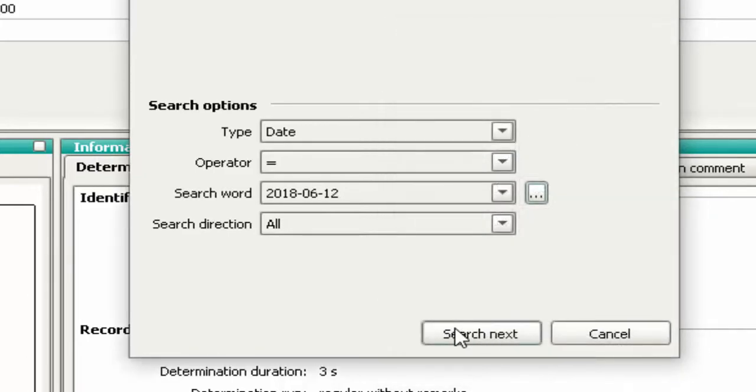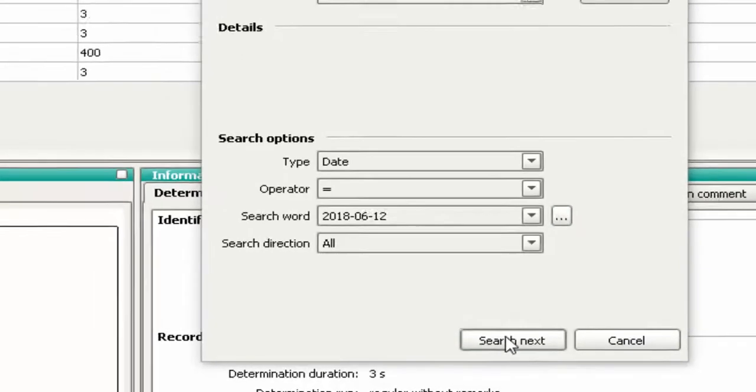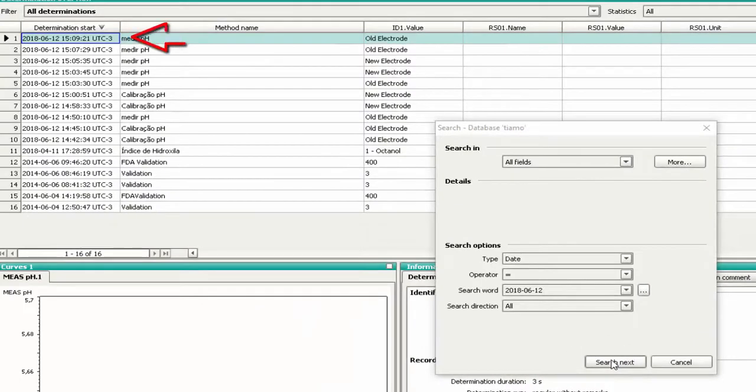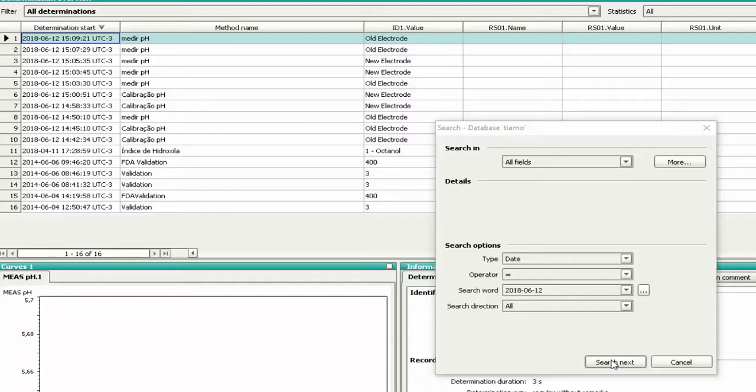Click Search Next. You will find in the database that the analyses performed on this date are highlighted. To find another analysis performed on this date, click the button Search Next.